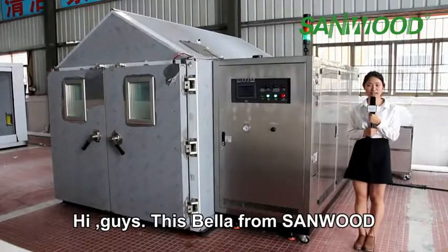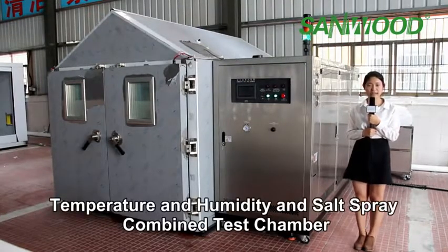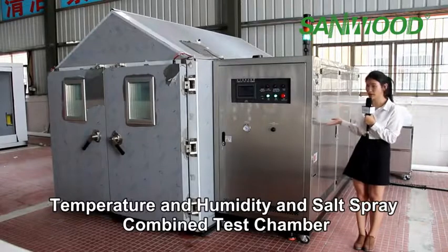Hi guys, this is Bella from Sunwood. Today I am going to introduce the temperature, humidity and salt spray combined test chamber.